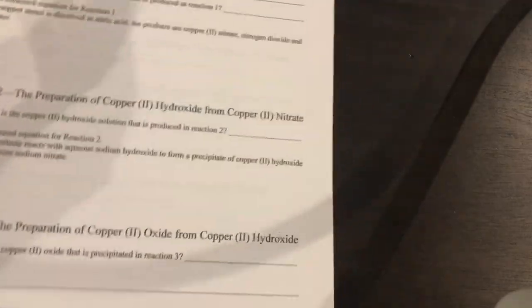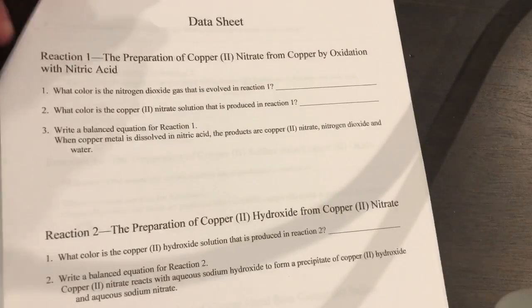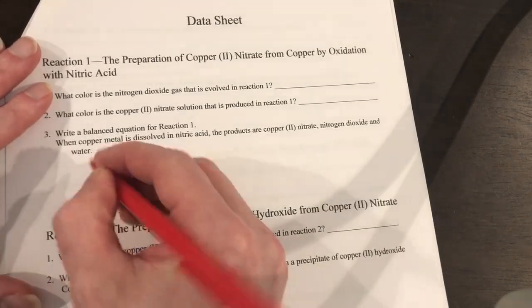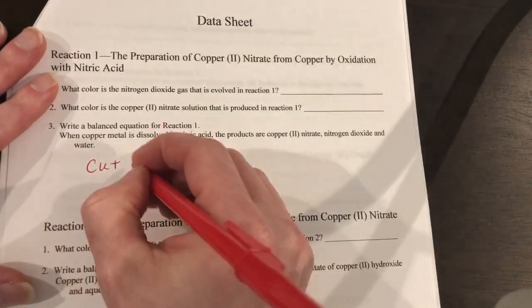Okay, so I'm not going to do all of these questions because I've pretty much already answered these. What color is the nitrogen dioxide gas that's evolved in reaction number 1? Well, it was brown. Okay. What color is the copper 2 nitrate solution that is produced in reaction 1? It's a light blue. Okay, so when we go to do our reaction, it says we're going to take copper metal and I'm going to react it with nitric acid. Okay.